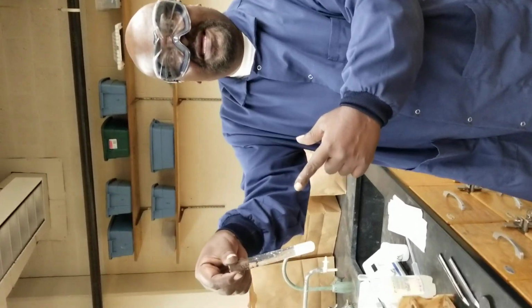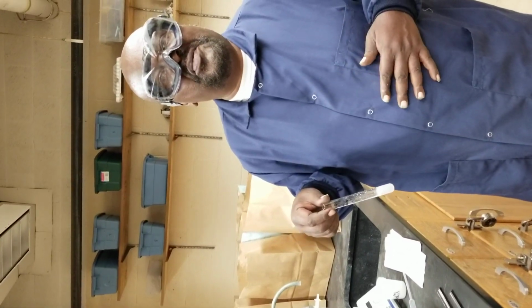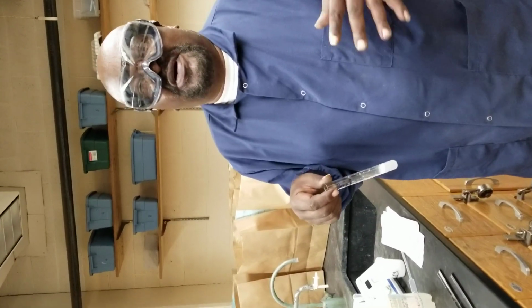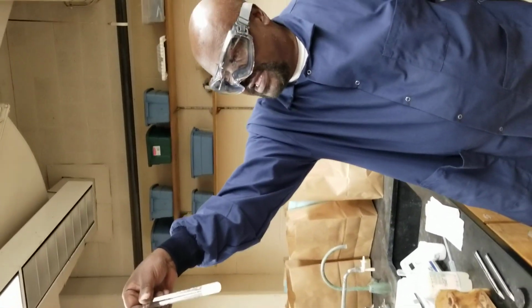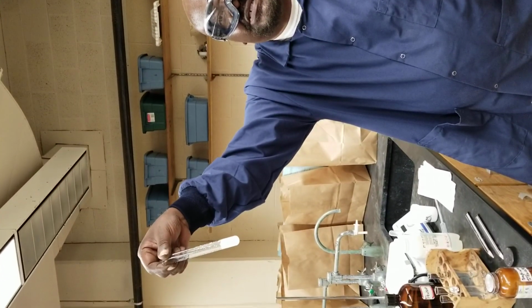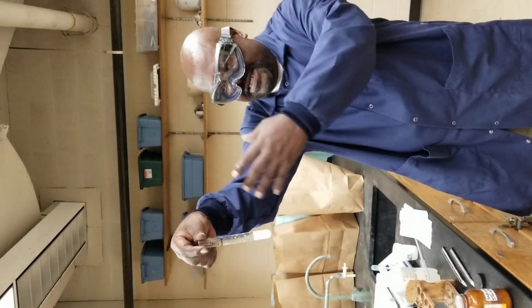Did anybody notice anything? It's lathering. Like kind of soap. You put soap in water and you shake it a little and you know what happens, right? Generally, lathering, yes, but certainly a nice solution form. Sodium stearate in water. Of course, if I let it sit, the lathering will go away, but you know that. All right, sodium stearate in water. There we go. Right, moving along.